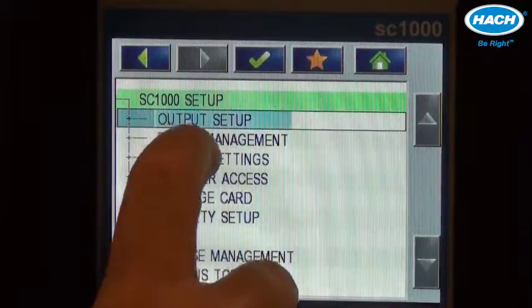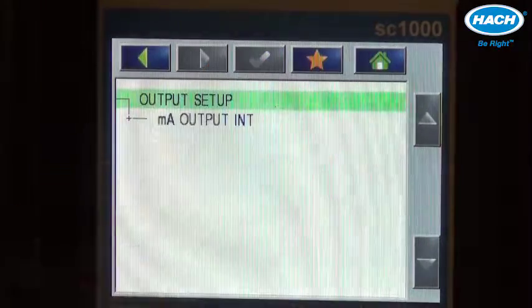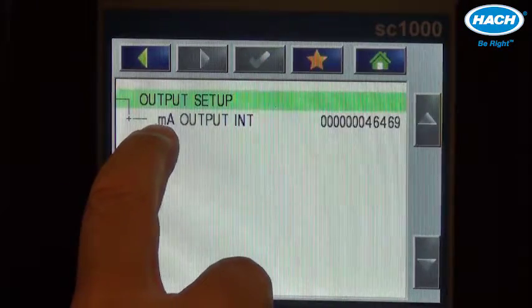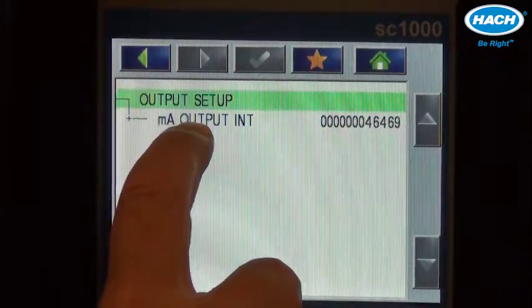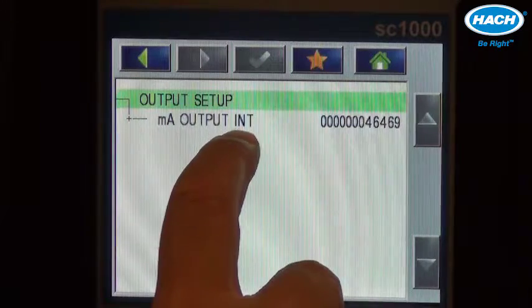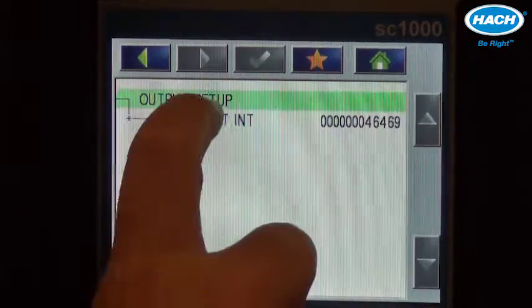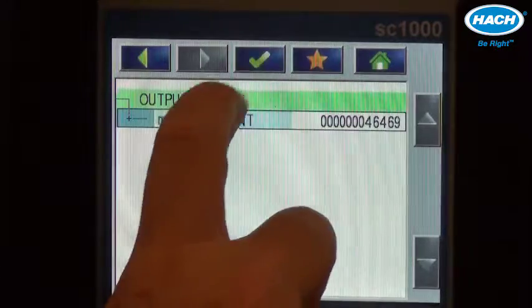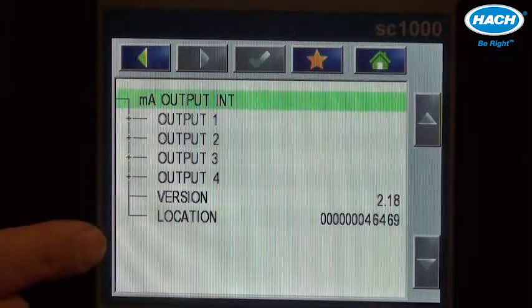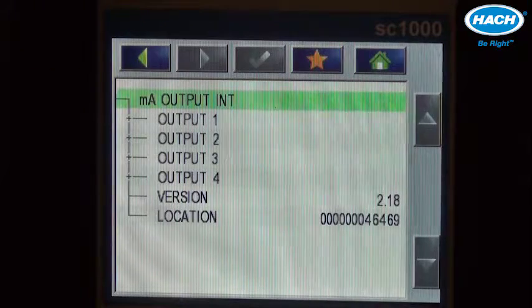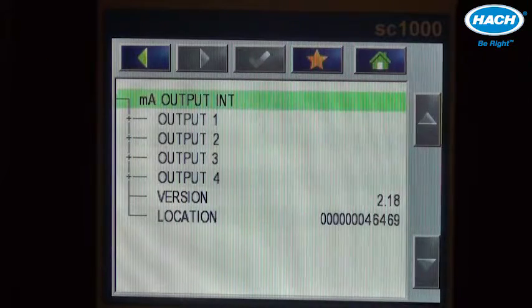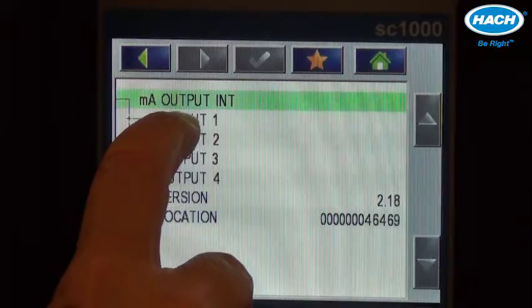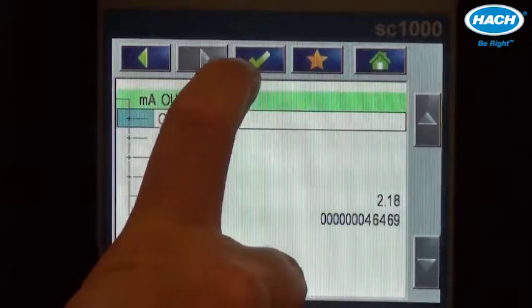We press that, press the check mark, and notice we have a milliamp output card that is internal to the probe module. We select it, and we can expand it out to four 4 to 20 milliamp outputs. We'll select the first.